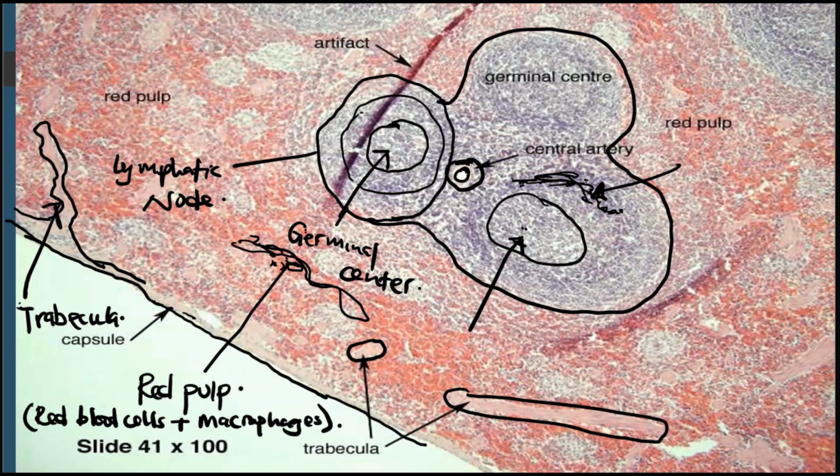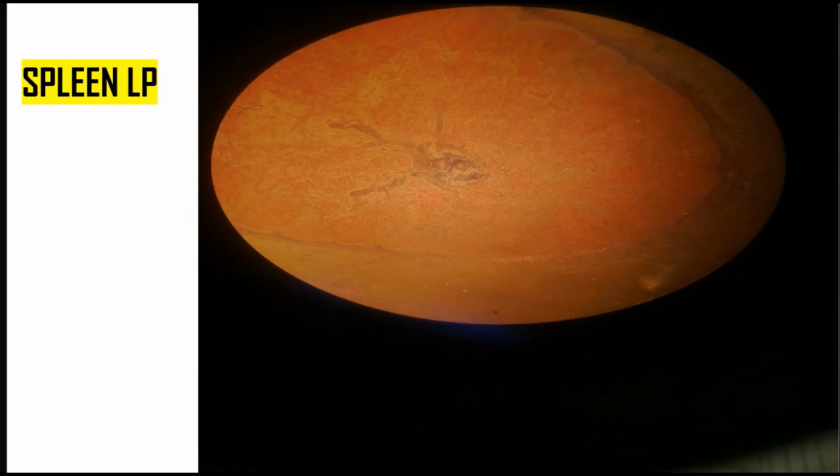Okay, let me show you another histological slide for the spleen. So this is the spleen at low power. At low power here, you just observe. Don't draw.